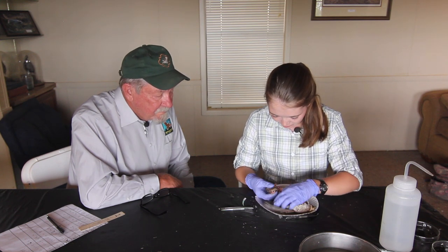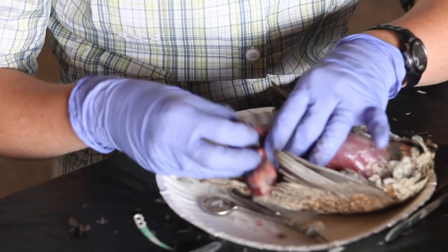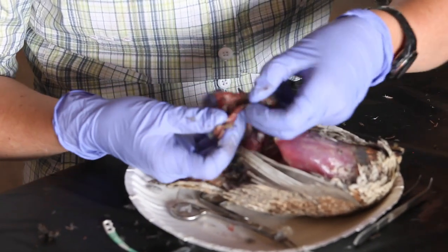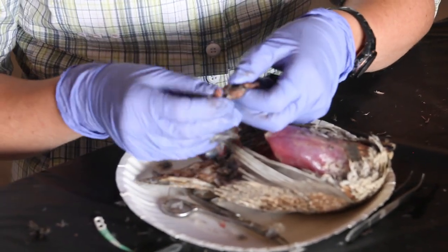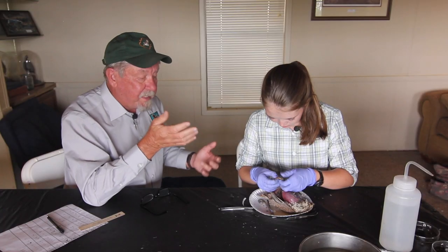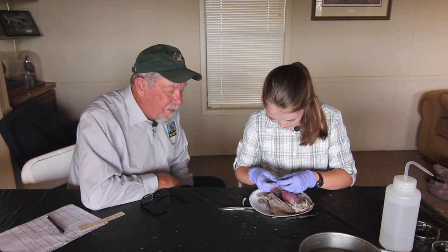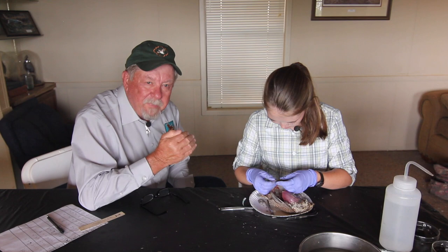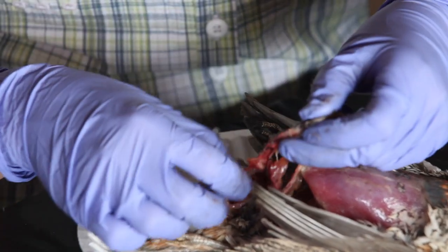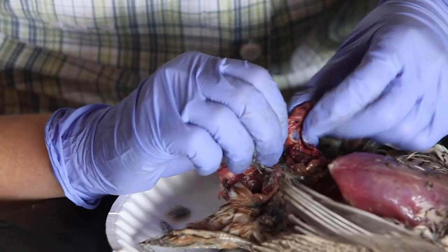And when we're looking for the cecum, it's going to be on the right side of the bird here. Or, yeah, the right side, your left side of the bird. And it's going to be this green striated mess in the middle of the intestines. Most of the intestines, the small intestine and large intestine, are a reddish pinkish color. But that greenish, kind of vile-looking color, and again, it's going to have this kind of a stripe pattern on it. You know you're looking at the ceca then. And again, it's a pair. Cecum is singular, ceca plural. So we're looking for both of these blind guts.